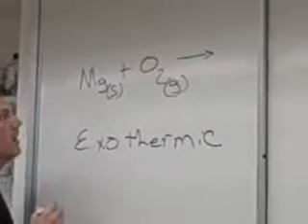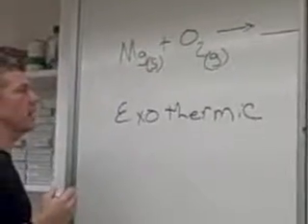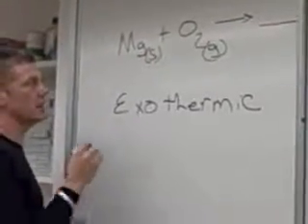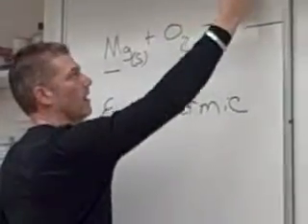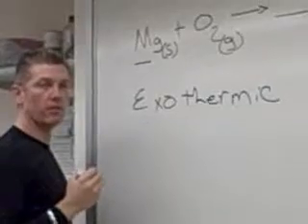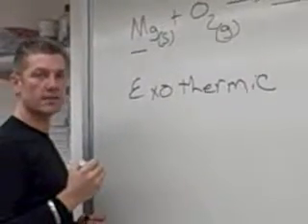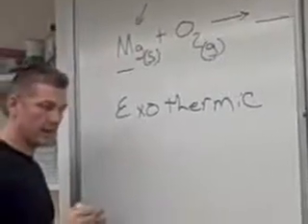In addition to determining what the compound is that's formed, I would also like you to predict, based on the amount of magnesium, whether the mass of the compound that's formed is greater than or equal to or less than the original mass of the magnesium reacted.